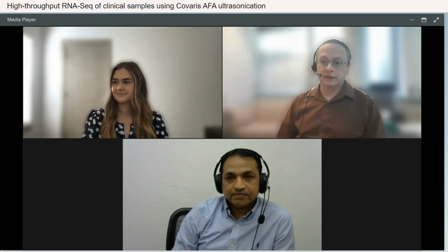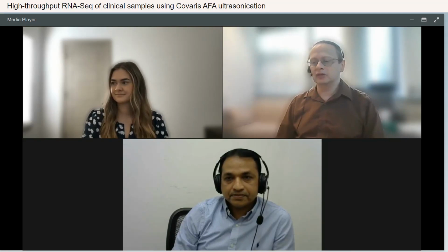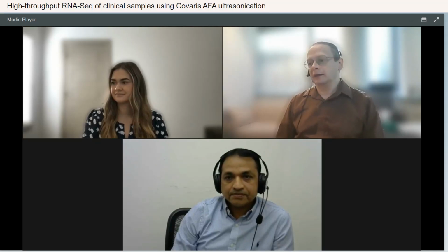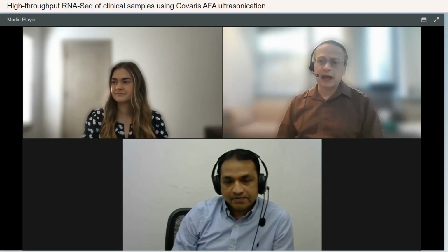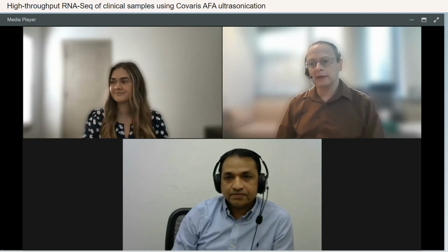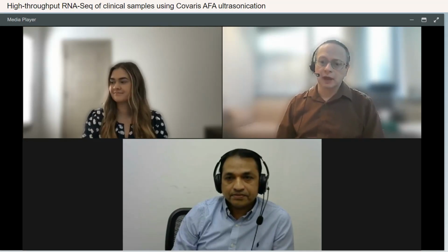It is also sensitive to the buffers, like I said, with the EDTA and other things coming in. And so it's hard to predict exactly what it will be, but it's going to work, provided you have enough sample. The Covaris allows us to kind of just stick our fingers in our ears and say, la, la, la. As long as the sample buffers are fine, we do a cleanup of the RNA beforehand to make sure there's nothing weird in the samples. We've gotten very consistent results. And so we don't have to worry as much about it.